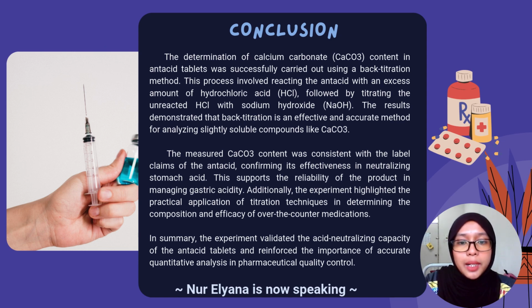Additionally, the experiment highlighted the practical application of titration techniques in determining the composition and efficacy of over-the-counter medications. In summary, the experiment validated the acid neutralizing capacity of the antacid tablets and reinforced the importance of accurate quantitative analysis in pharmaceutical quality control.